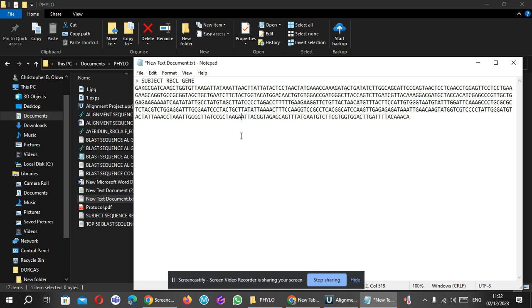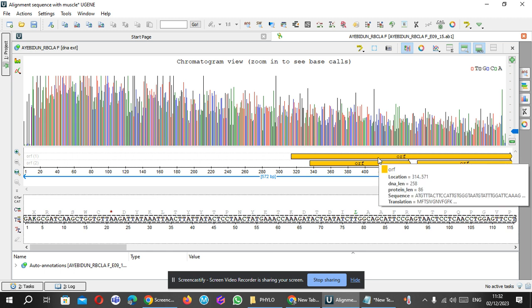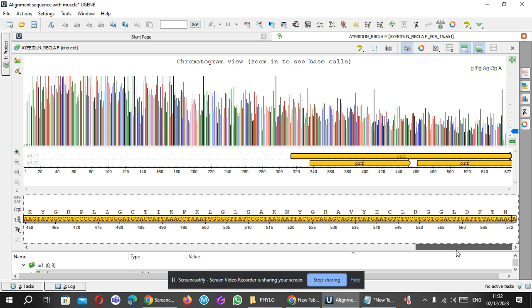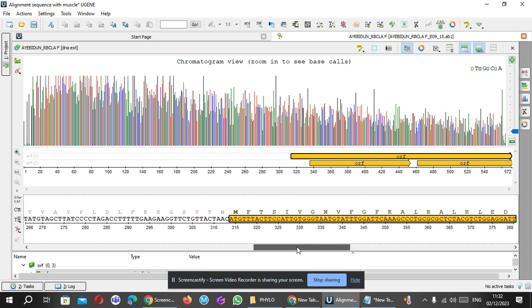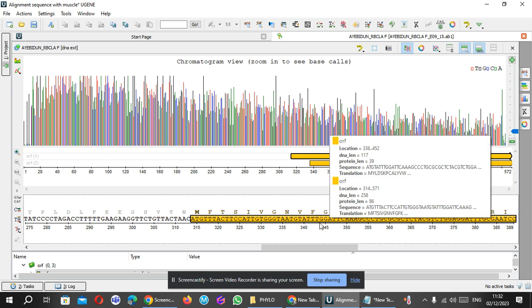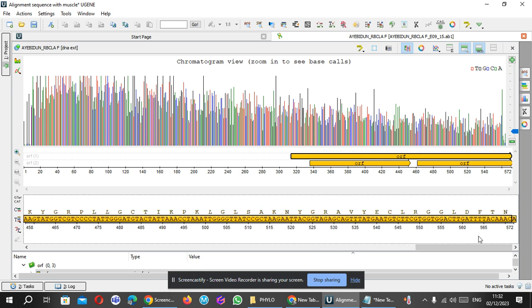I now pick primers based on the region which this longest open reading frame is telling me. So whichever primer I'm going to design will be a primer that sits within this region. Yes, this is the region. This is the sequence, so we can easily look at how the nucleotides are arranged and look at the GC content to pick a region where we will tell the NCBI algorithm to design primers for us. But that is not where we are going.